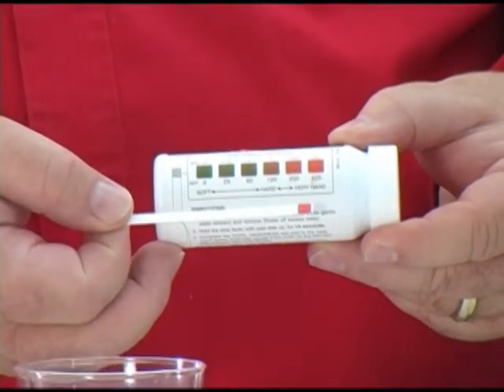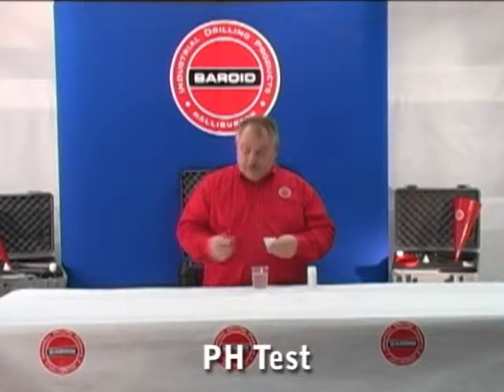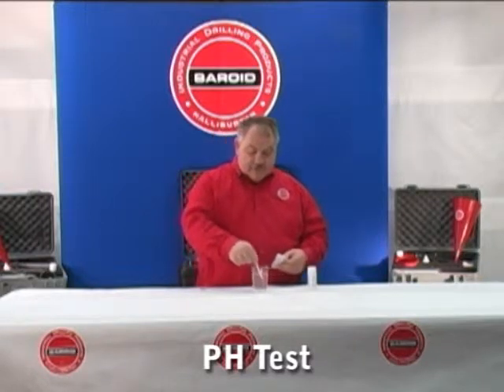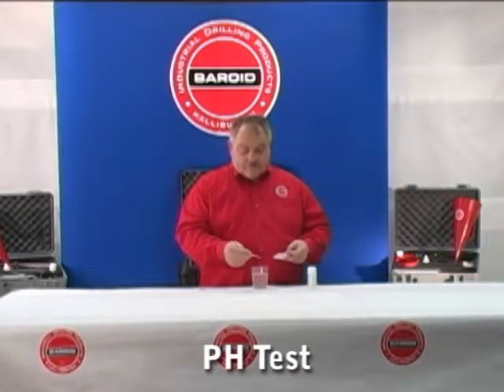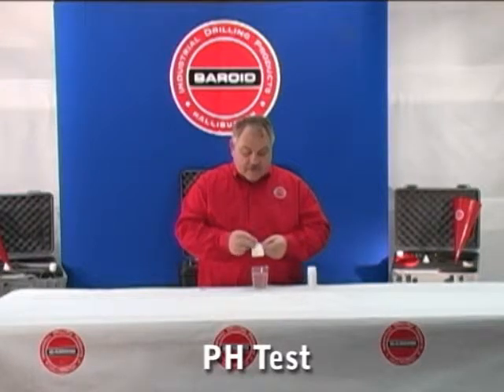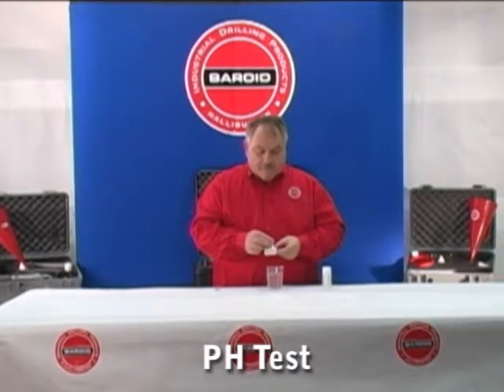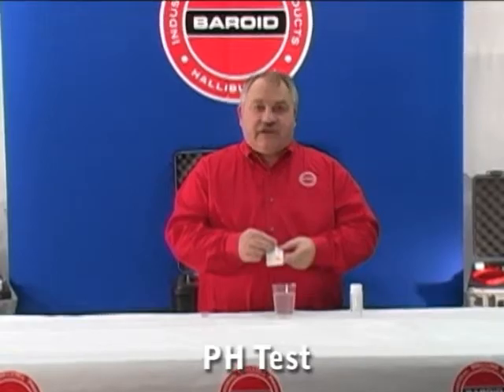Very hard water. We can check the pH of the same water using pH strips. Dip the strip in, allow about 15 seconds for the color change, and then compare the color with the color on the container. In this case we're showing a pH of approximately 6.